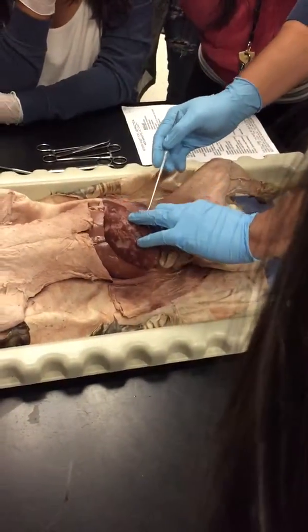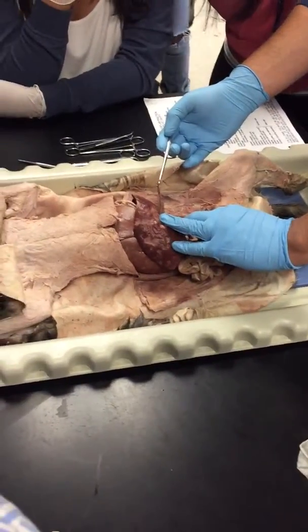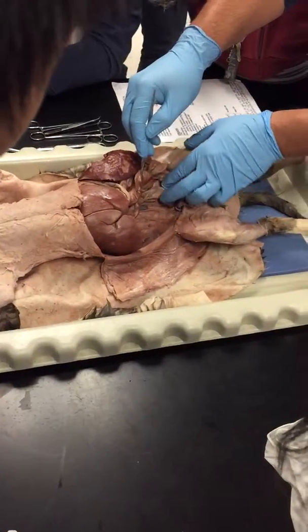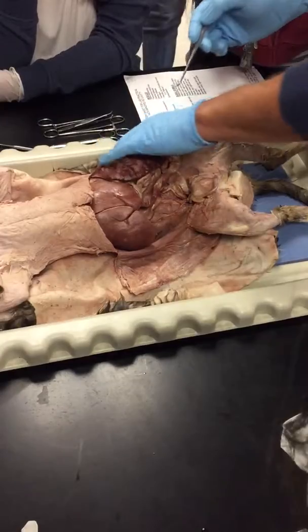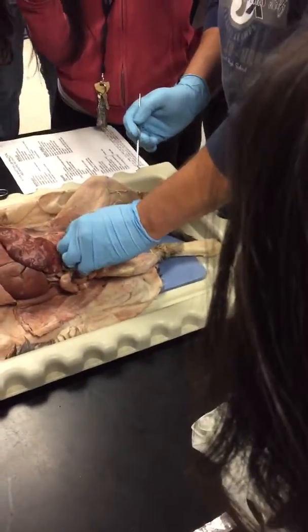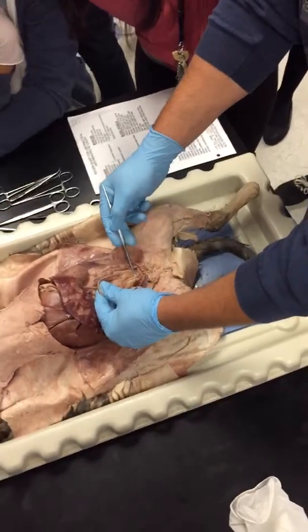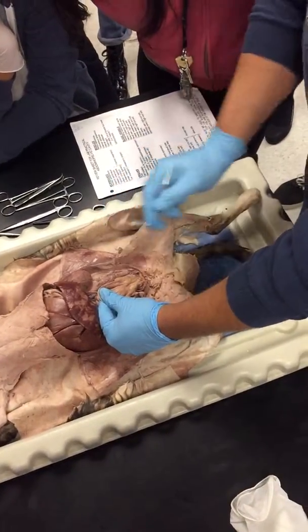And then connecting the kidneys to the bladder. Oh, nice. Madeline did this, didn't she? Is the other one intact? Yes, the other one's intact. Okay, the ureters right here. I just guessed. I know, but you got it. And then where the urinary bladder narrows down into this tube right here, that's the urethra. That's how urine leaves the body.